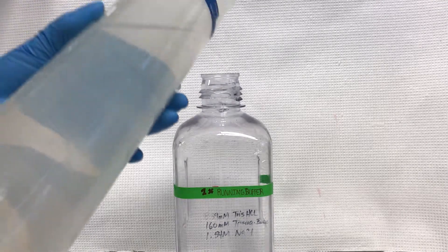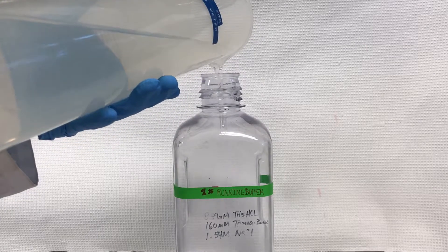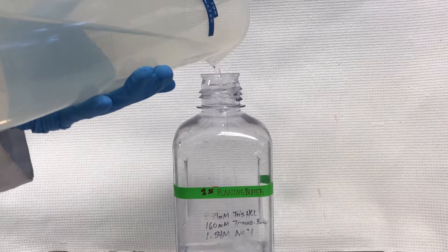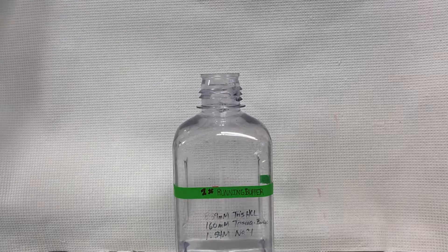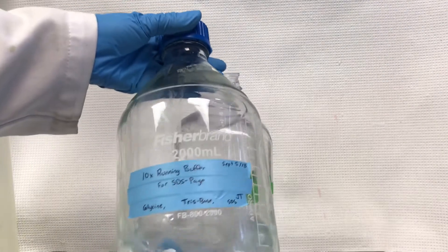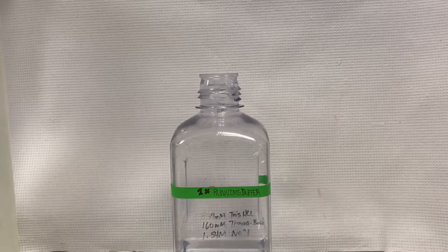Pour 200ml of the 1800ml distilled water into the buffer bottle. Then add 200ml of 10X running buffer into the buffer bottle.